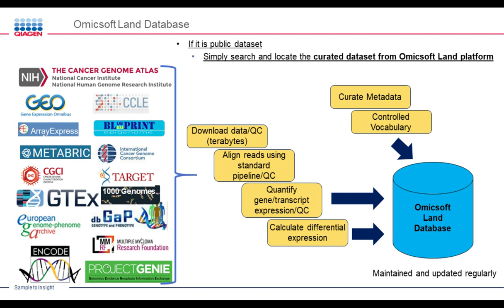Now, many users not only use their own data set, but are also interested in locating interesting public data sets. If you're one of those users, then what you would probably have to do is download the data from the public domain. This data can be gigabytes, if not terabytes.